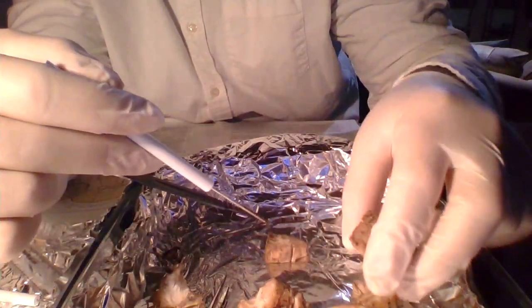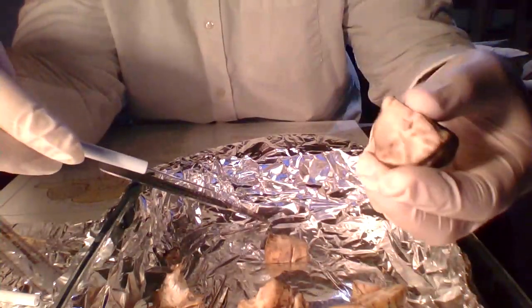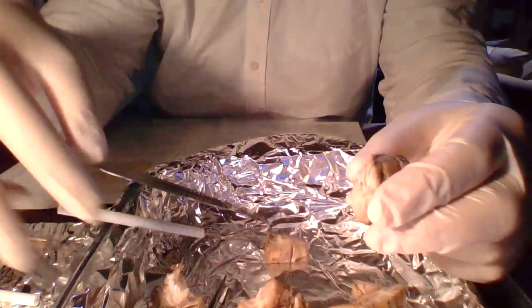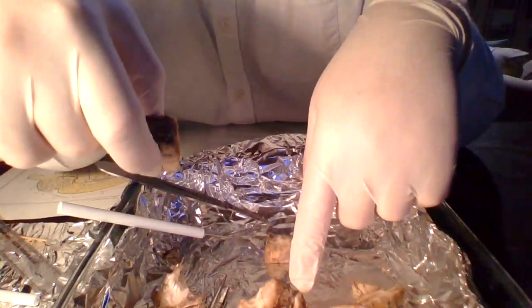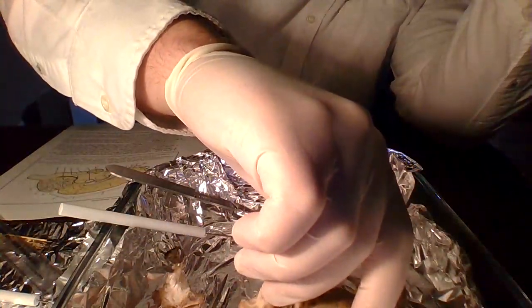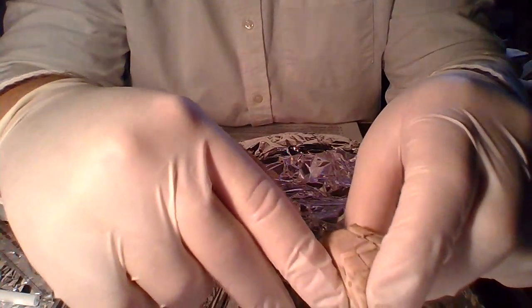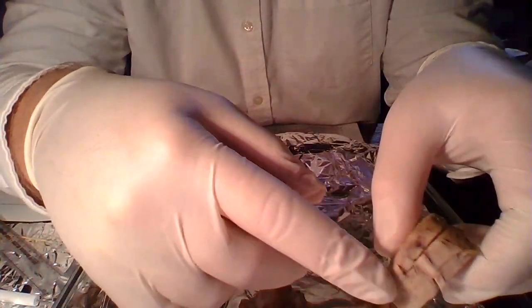Let's see if we can see it comparatively in this structure here that I cut. So this would be the frontal cortex. This would be posterior. If I was to guess, it would be somewhere around there. There doesn't seem to. As you can see, we do have the caudate body that's going back.